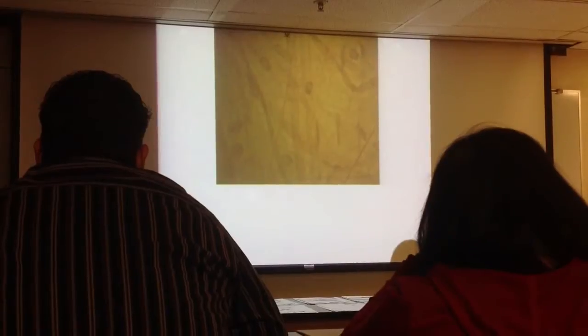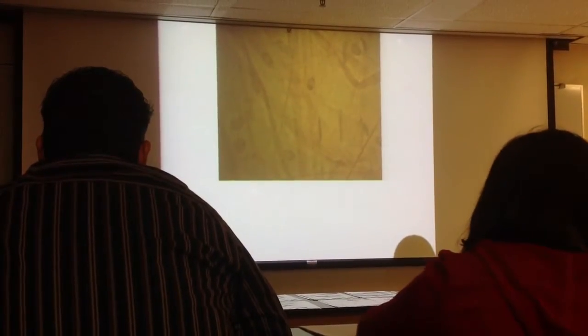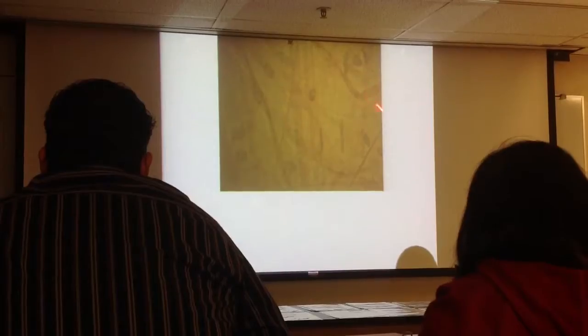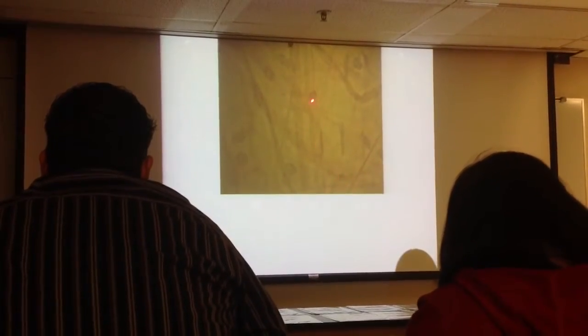Type of tissue. Areolar CT. What's that thick thing right there? That's a collagen fiber. What's this hair like over down here? Elastic fiber.